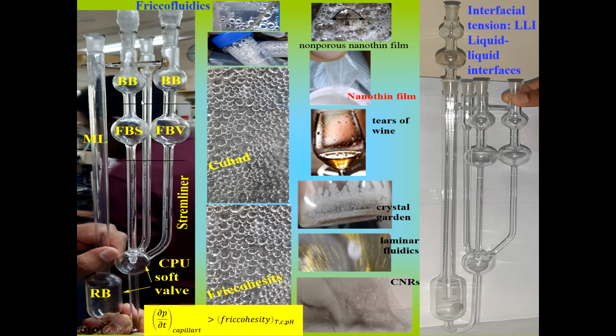So now when we are measuring, first we evacuate the solution by removing the piston, removing the stopper from this side, and the pressure is completely equilibrated, and now here pendant drops are developed. And the pendant drops within these two things are measured. Similarly, the sample is also uplifted, so a piston is fitted here to the functional bulb of the viscosity unit, and these two are stoppers, and it remains open. So the solution similarly comes.